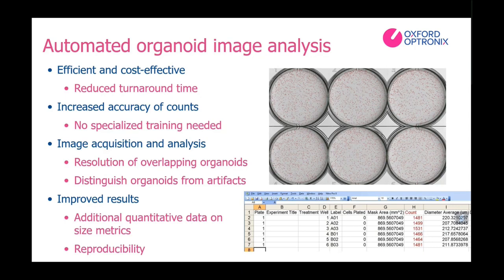Finally, one last major advantage of these automated systems is that entire experiments can become fully automated and reproducible under the exact same settings, regardless of whom the user is. Since the defined settings can be stored for a specific organoid type, that means these settings can be reutilized for similar studies, thus eliminating most human involvement and further removing the chance of bias from a study.